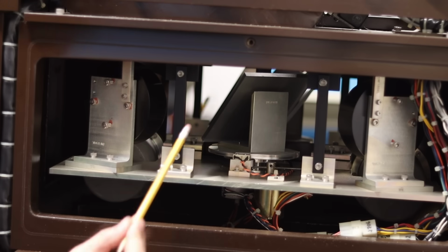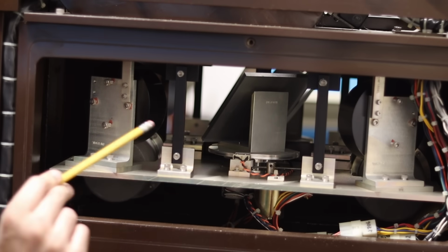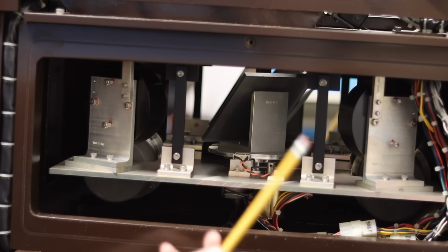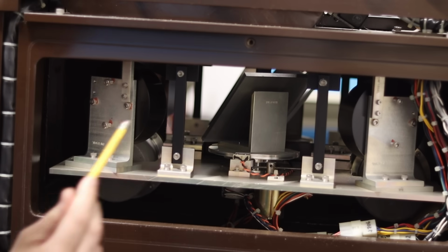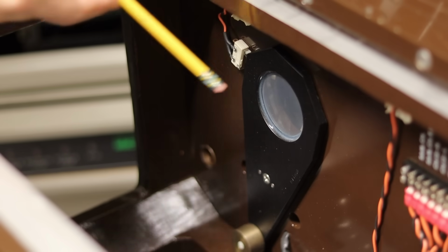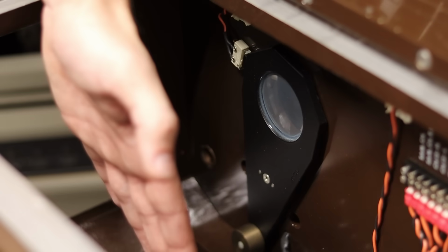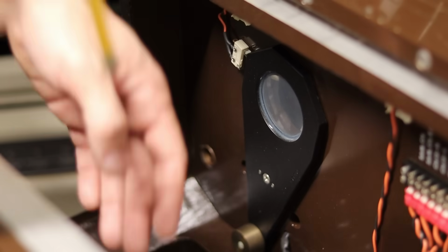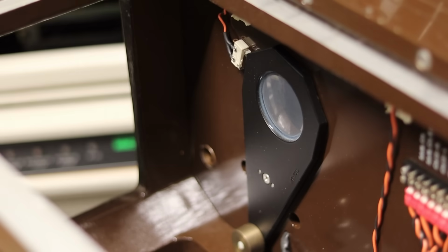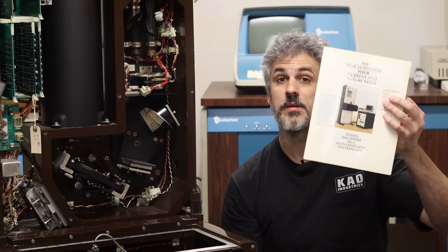Once those recombined beams come out the bottom, they hit this mirror here, which is a steering mirror that can send it to the left or right side, so you can have two different detectors. And then it does a little bouncing around and shoots right back out the front. It passes through this little window here. The object under test goes right here in the middle, passes through the object under test, and finally into the detector. And we can actually see everything that I just showed by looking in the brochure here.